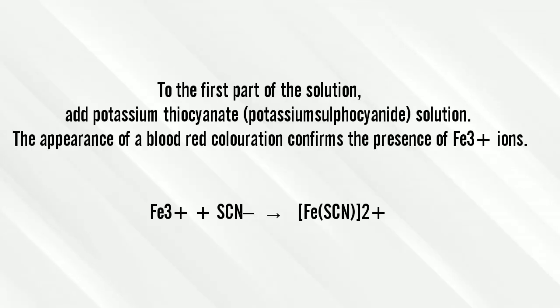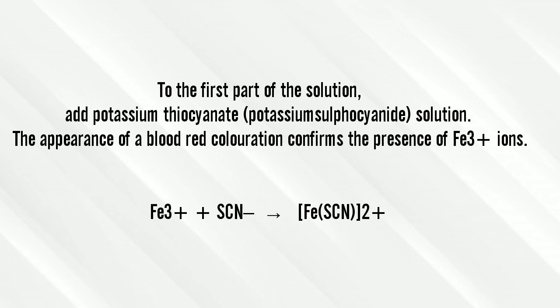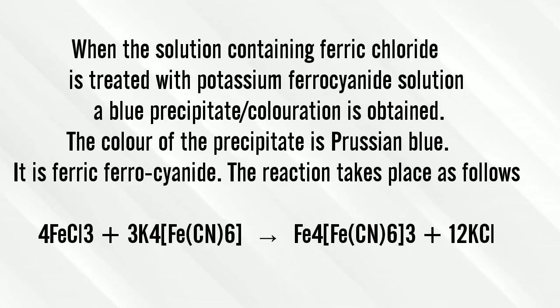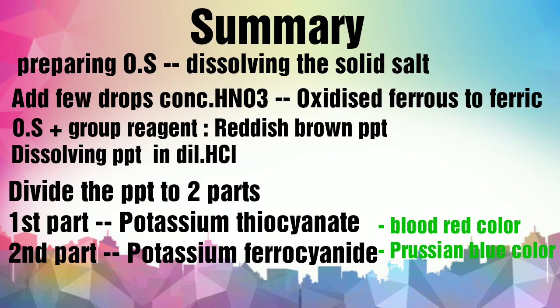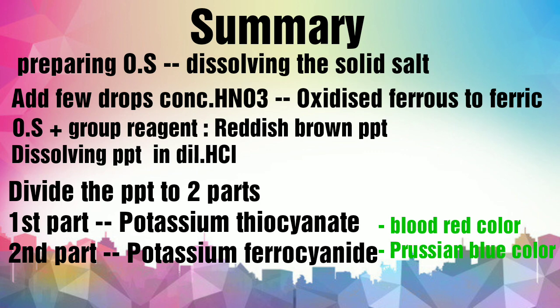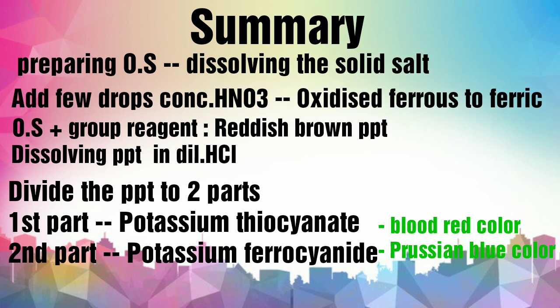The potassium thiocyanate reacted with the ferric ions forming ferric thiocyanate, which has blood red color. This is used in the classical fake blood experiment. The potassium ferrocyanide reacted with the ferric ions forming ferric ferrocyanate, which is Prussian blue in color.